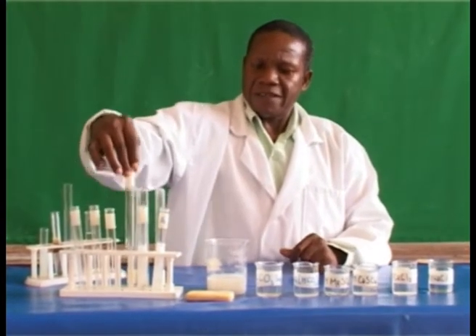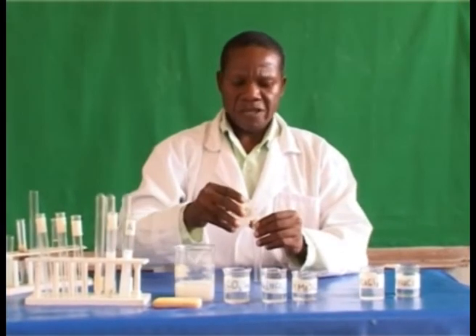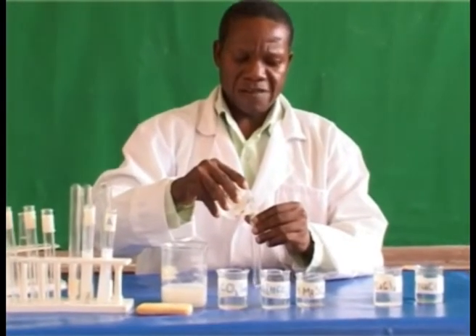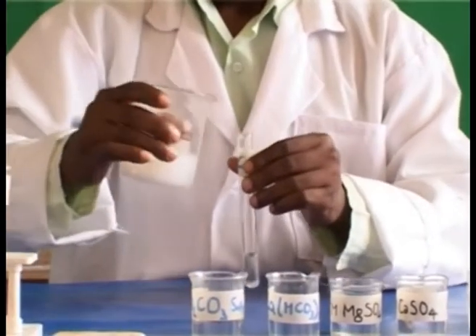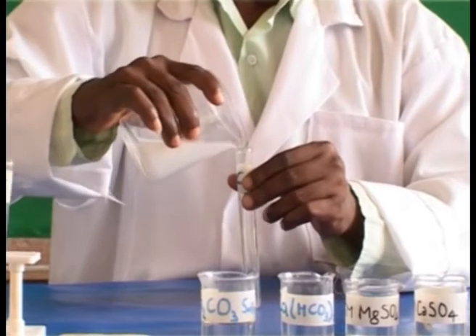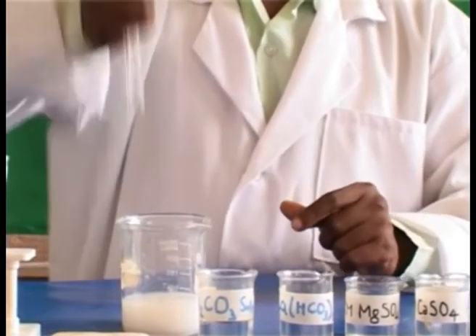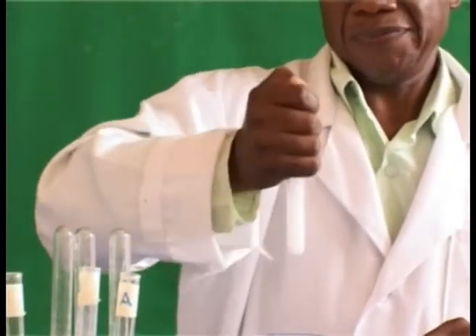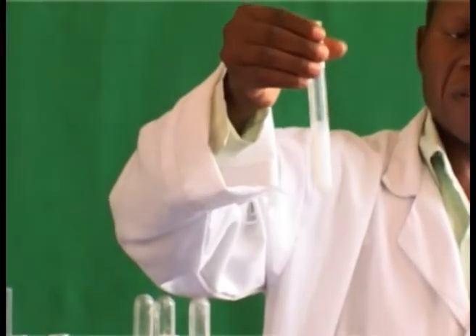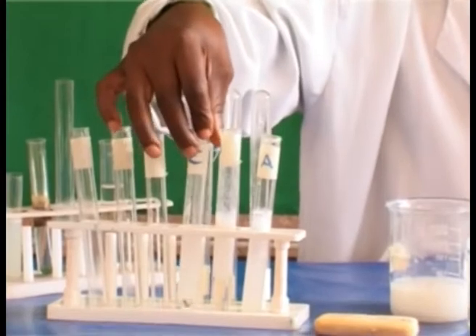Let's take test tube C, put a little amount of the prepared calcium sulfate, followed by a little amount of the prepared soap solution. Then check if we can produce lather or not. No lather produced. Let us put it in the test tube rack to check what will happen.